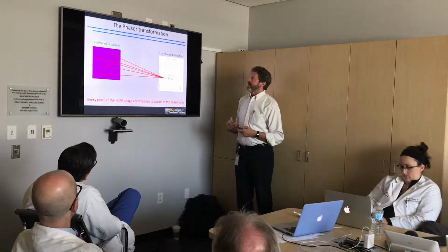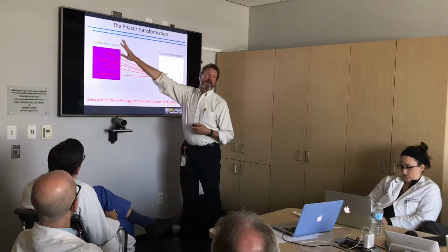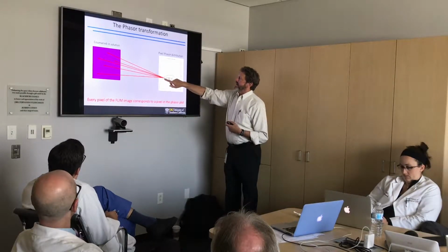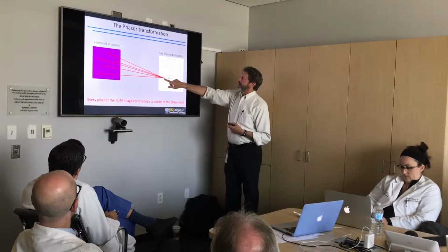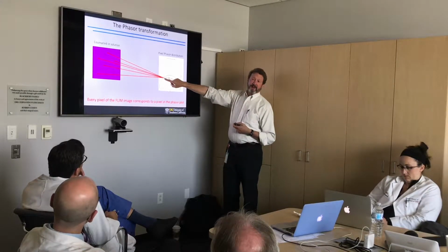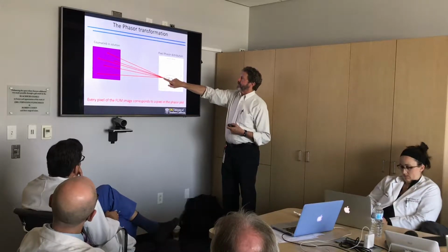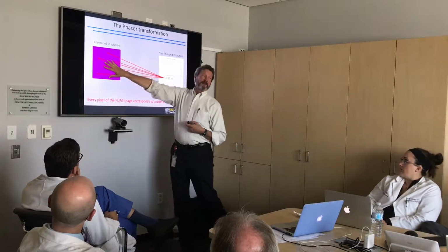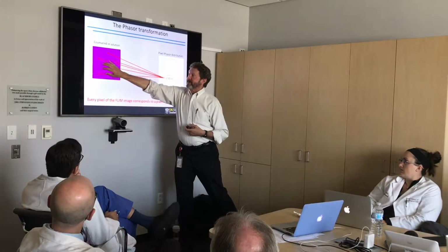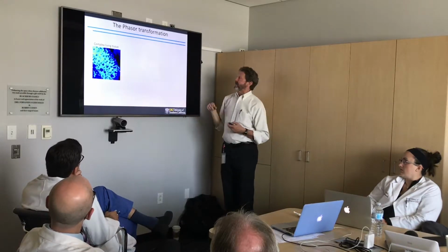Extending it a little bit further along, just to give you an example, if I have a whole field of view of a dye like coumarin, and I look at it on the phasor plot, all those pixels would be at the same spot. So I could, in the software, put my pointer here and say, show me all the places that have that lifetime. Or I can point to something here and say, tell me what the lifetime is. This is the simplest case.